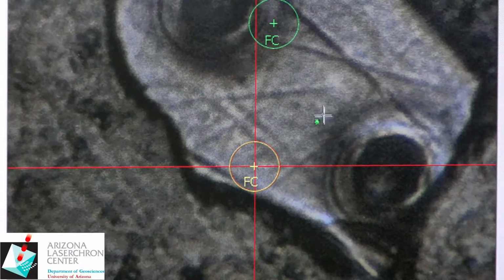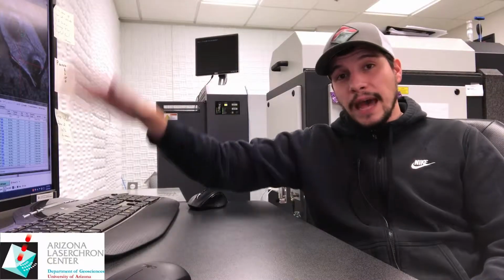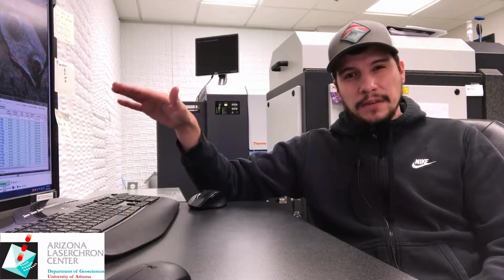At this point, what we want to do now is to set this focus to everything in our scan list. Because as you saw when we hit go to on that first spot, it was out of focus. So now we want to set everything to the same focal length because we polish it as close to perfectly flat as possible. There should be no pitch on any of these mounts.